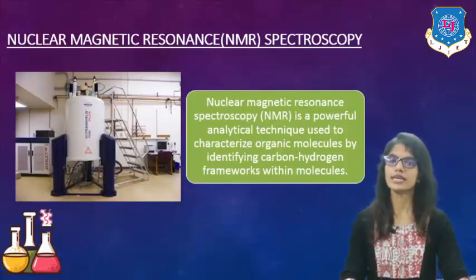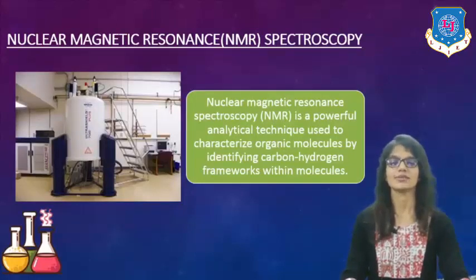Okay, so nuclear magnetic resonance spectroscopy is a powerful analytical technique used to characterize organic molecules by identifying carbon-hydrogen frameworks within the molecules, right? You can see here the instrument which is known as the NMR instrument. It is available in various sizes. Depending upon the size of the magnet, the size of the instrument changes.